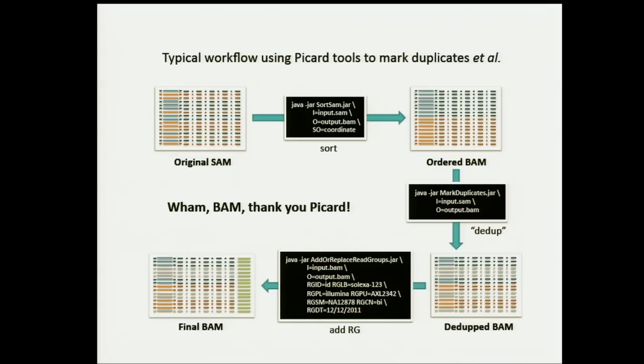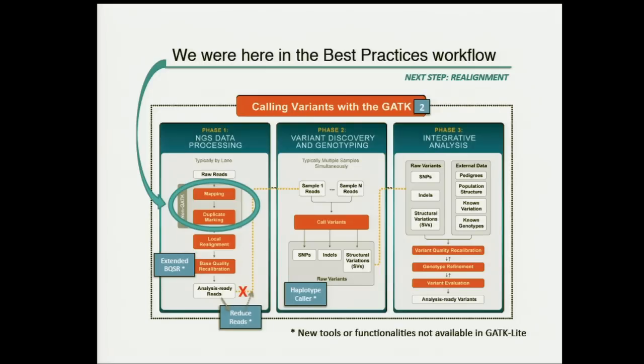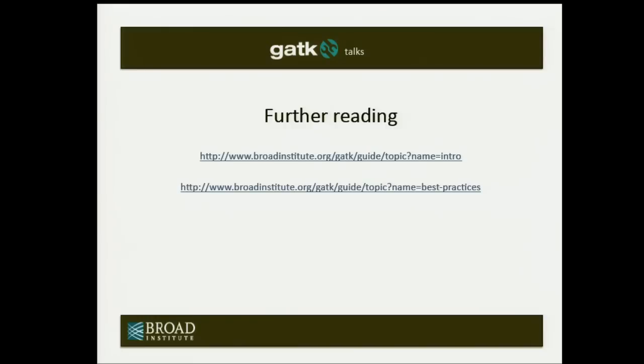Yeah, so we're out of time. This is just to conclude, I just want to recap what we did here. We aligned and we deduped, and this is where we are in the pipeline. I think the next one will be local indel realignment. Thank you.